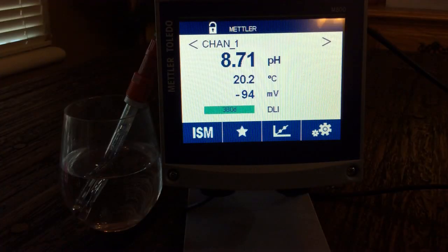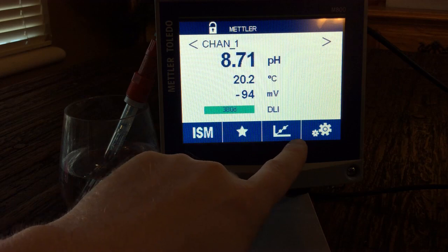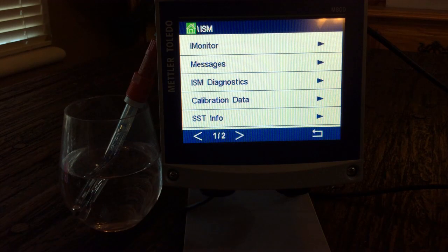Let's take a look at some of the features in setting this up in the menu. We have our ISM, our favorites, calibration and maintenance, and settings tabs. This is a touch screen transmitter. Going into ISM — ISM stands for Intelligent Sensor Management.